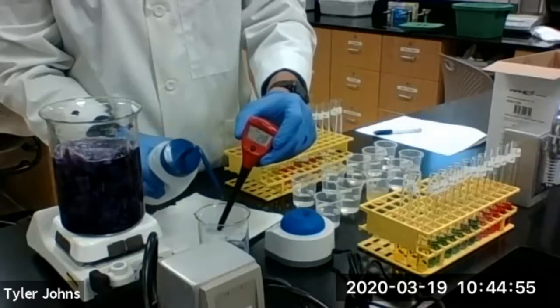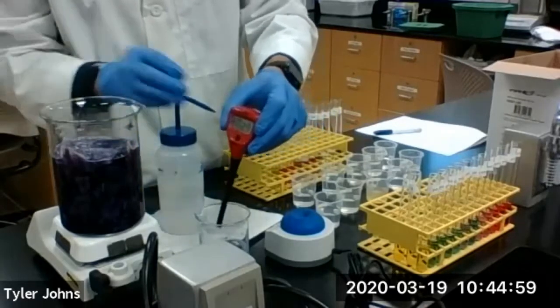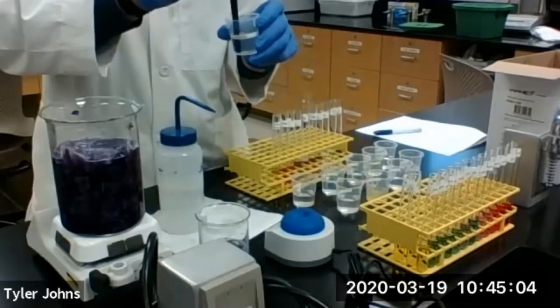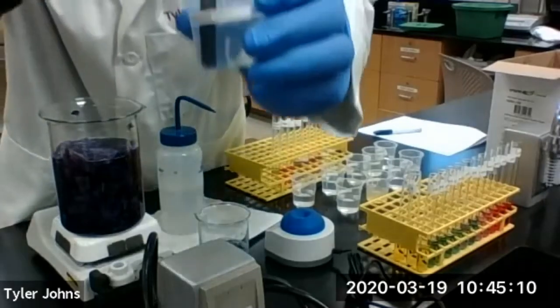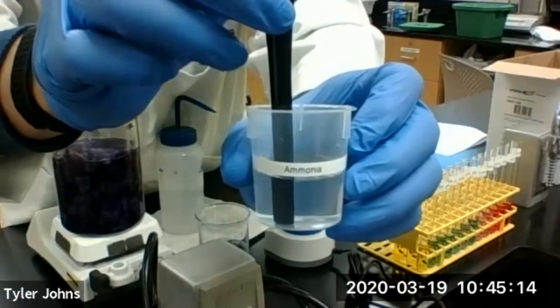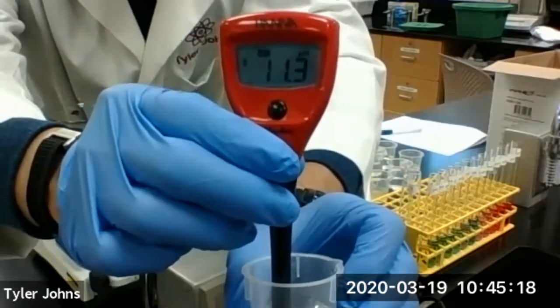Rinse our pH probe again, and we'll move on to our last solution, which is our household ammonia. We have our household ammonia solution and our pH.